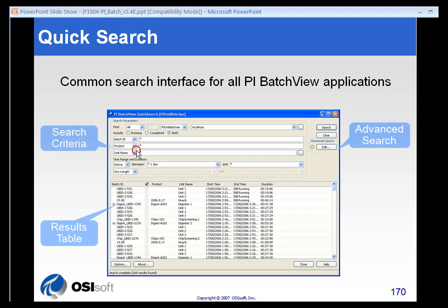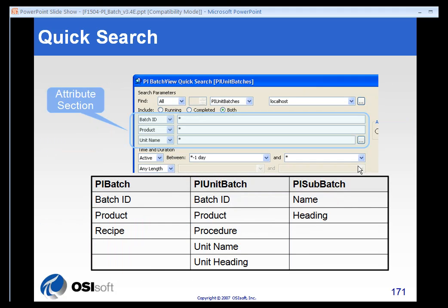You have some basic search criteria. Results are shown in the lower area, and they are expandable. There's even an advanced search button that you can use to add various parameters.